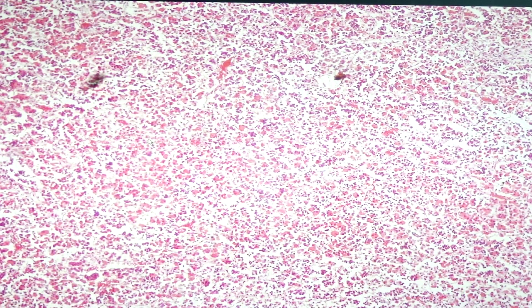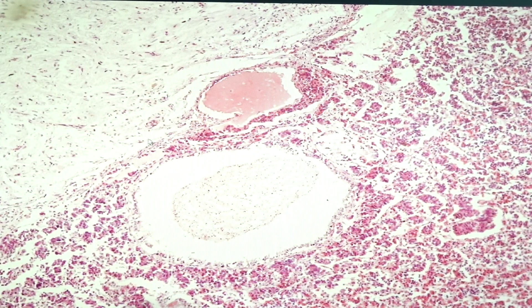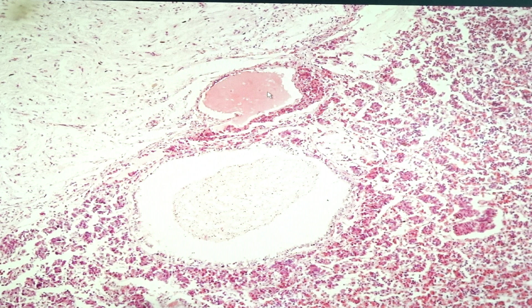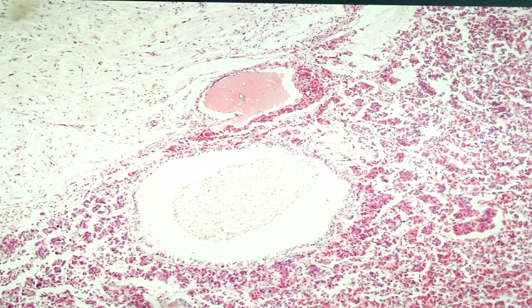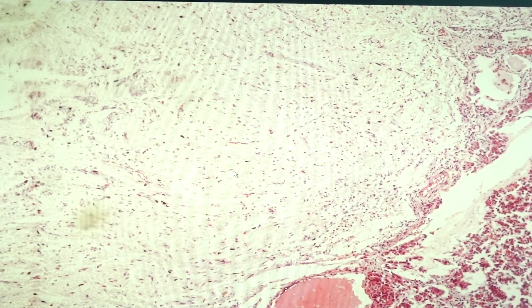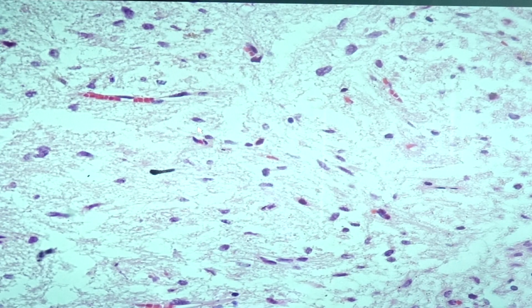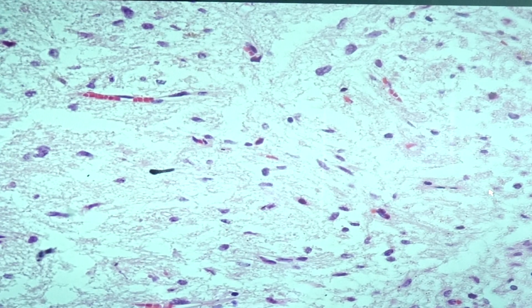Another region of the adenohypophysis contains cystic structures with colloid — though this is not the same material found in the thyroid gland. This would be the pars intermedia. The pars nervosa contains unmyelinated axons. The cells visible here, identified by their nuclei, are what we call pituicytes.